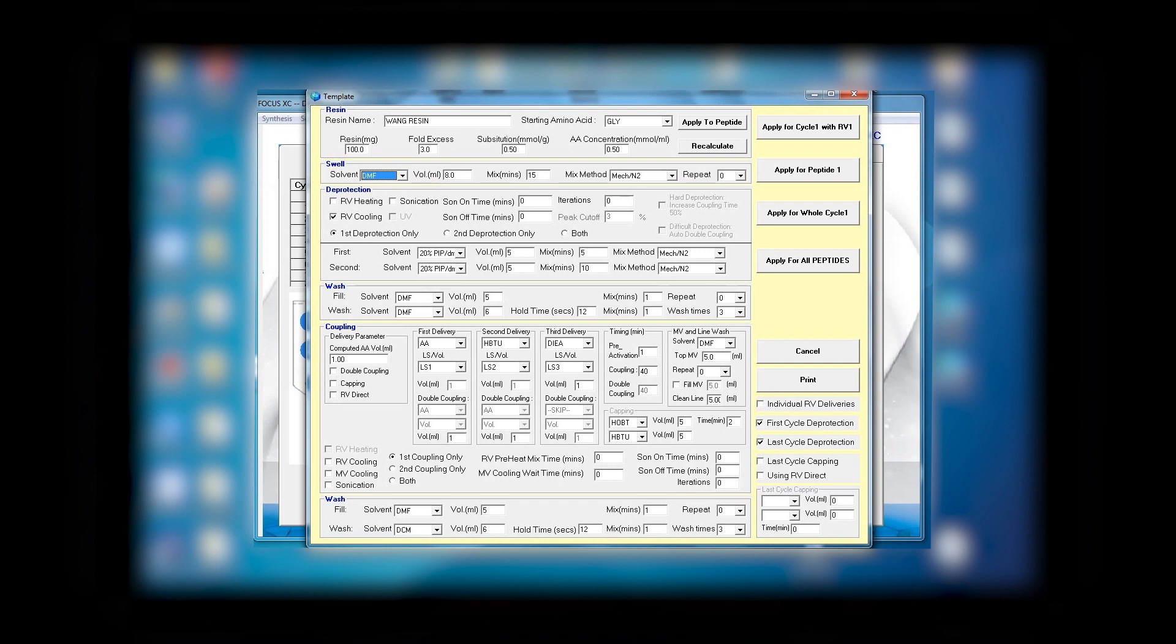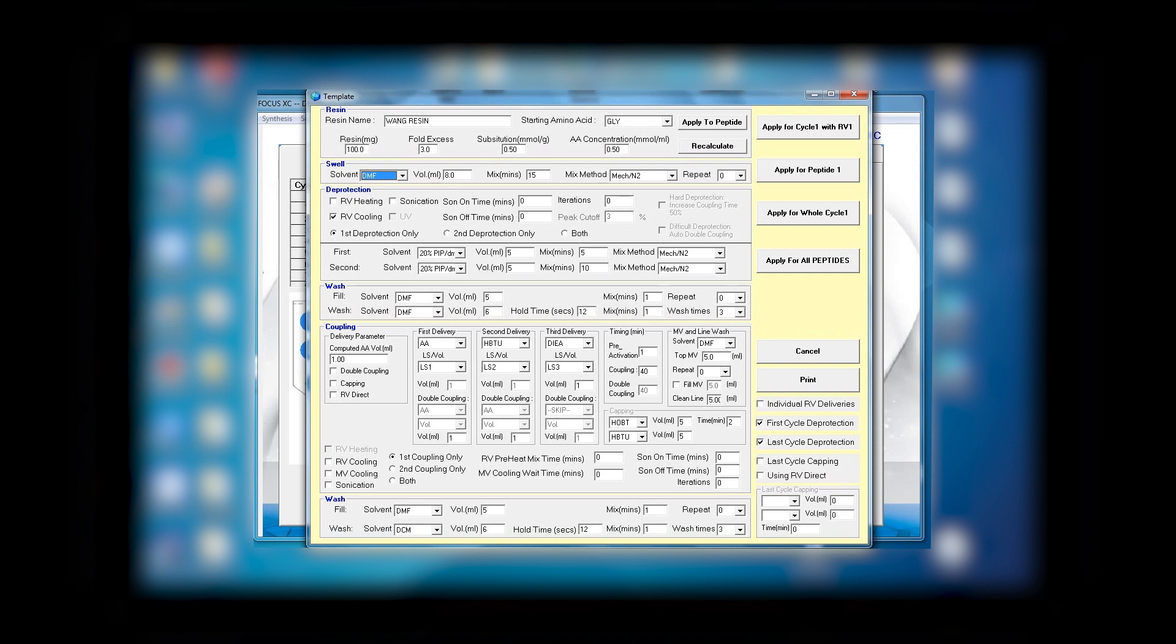The next section is swelling, where you have DCM or it could be DMF, for example. The volume is 8 milliliter with mixing of 15 minutes using mechanical and nitrogen is perfect. Under deprotection, if you want cooling you can select it, but in this example we do not need that. You see that for the first amino acid you have 20% piperidine in DMF.